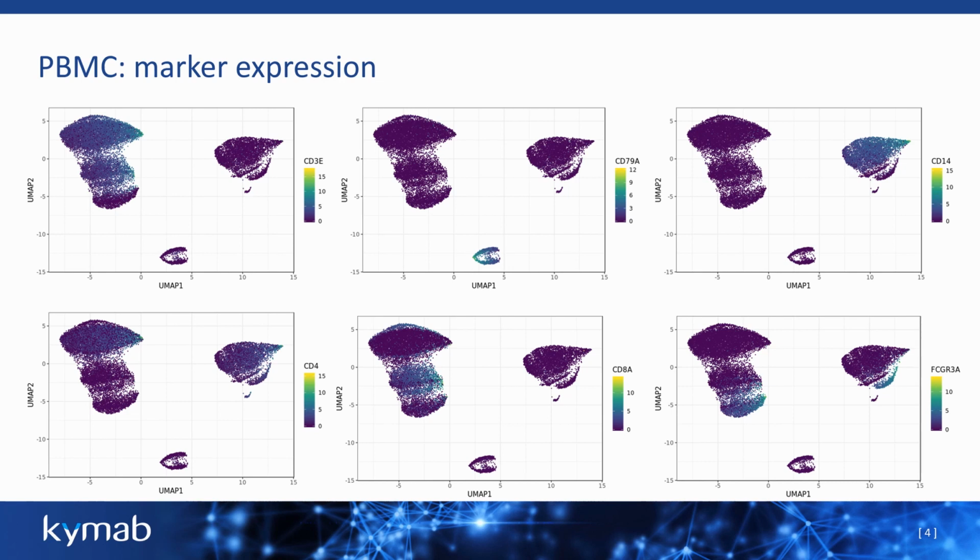If you can imagine that on a data set of over 60,000 cells, tSNE does take quite a while, whereas UMAP goes through these in maybe 30 seconds, maybe a minute on a standard desktop computer. So it's a very efficient algorithm, but in terms of what we're visualizing here, it's very similar to tSNE. So these are the two-dimensional projections that we get from the PBMCs.